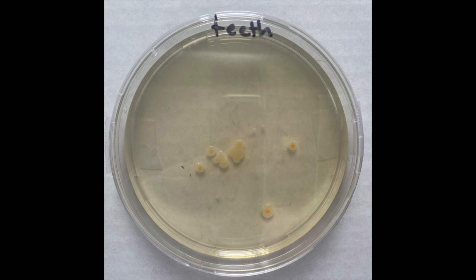Moving on to something slightly less disgusting — we swabbed Audrey's teeth, and you can see on this plate that there is some bacteria forming. This has the potential to be Streptococcus mutans. As we discussed in our previous video, Streptococcus mutans is one of the bacteria that can cause cavities.